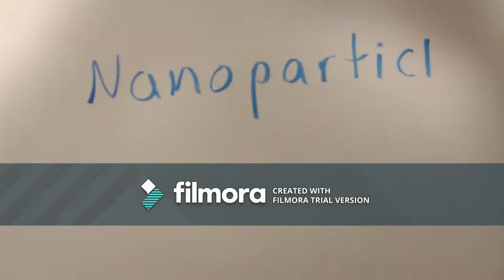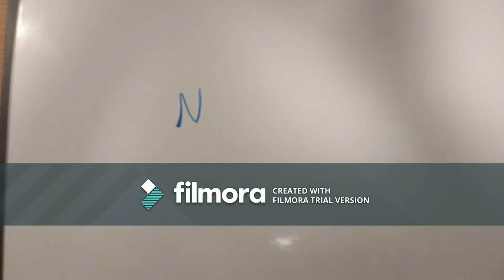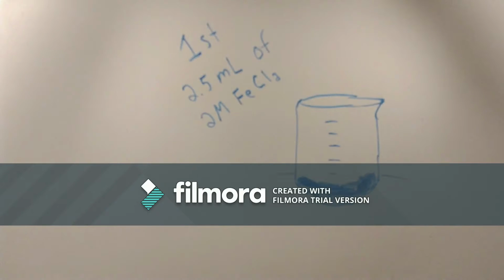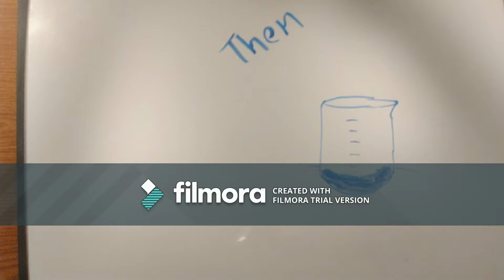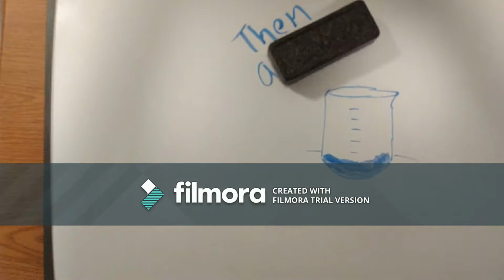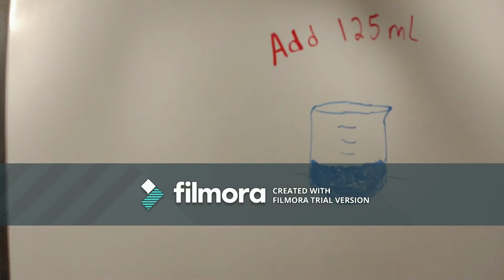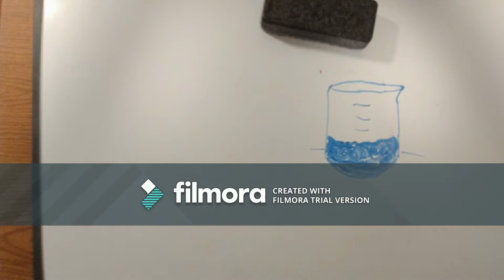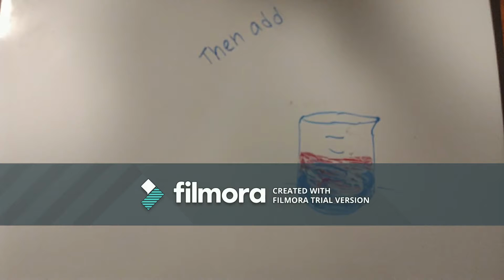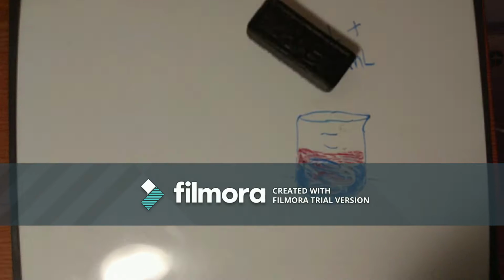Now we're going to talk about the nanoparticle synthesis. First, we added 2.5 milliliters of 2.0 moles of iron 2 chloride. Then added 12.5 milliliters of 1.0 moles of iron 3 chloride to the same jar. Then added 125 milliliters of 1.0 moles of NH3. This is the ammonia solution, and we added it to the same jar by using a plastic pipette at a slow rate. Then we added our variation, which was 25 milliliters of citrate plus 25 milliliters of DI water.